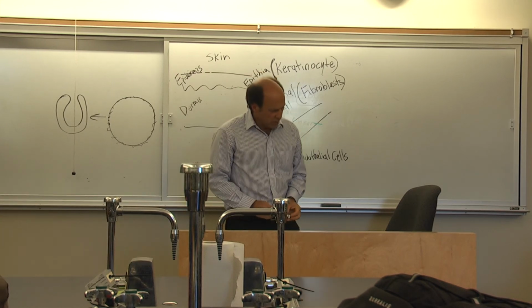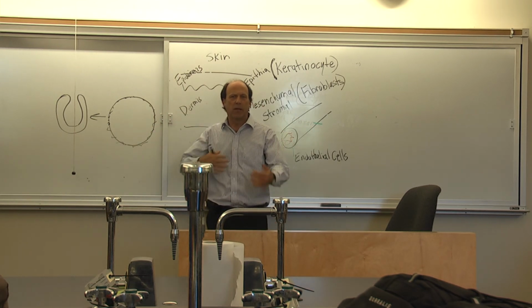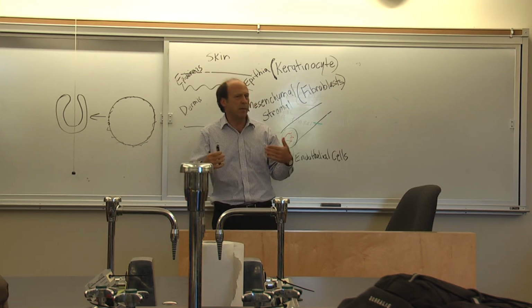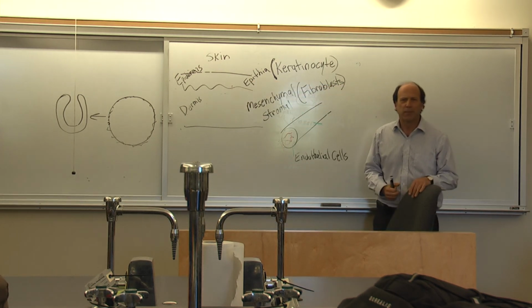Okay, so we're just about to go into the lab. We talked about what we're going to do. We're going to count cells. It's a tool that we need for what we'll be doing in subsequent weeks. There are two different methods you're going to learn, and you need to be able to tell me the total number of cells, not just the cells per mil.